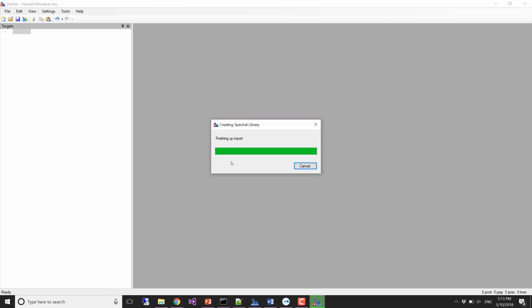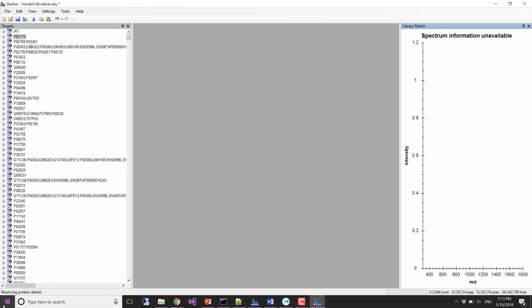Technical limitation. Yeah, I mean, you can. I was sort of looking at one is I would be doing this on a desktop. It's just going to go lots faster on a desktop. Even this computer I was looking at has like a 2.5 gigahertz processor, and I'm used to being closer to like 3.7 or 3.8.